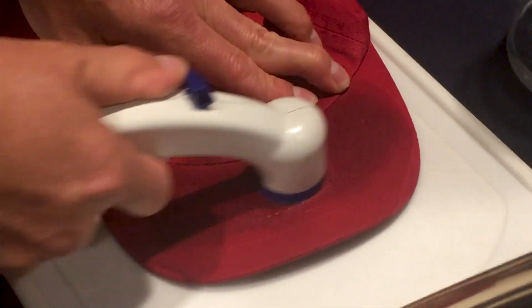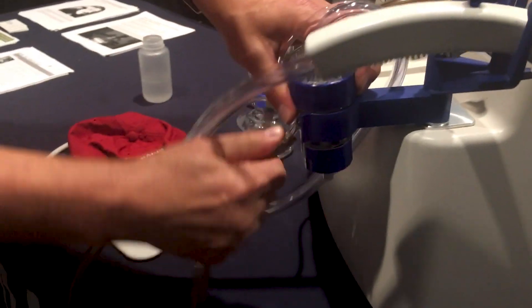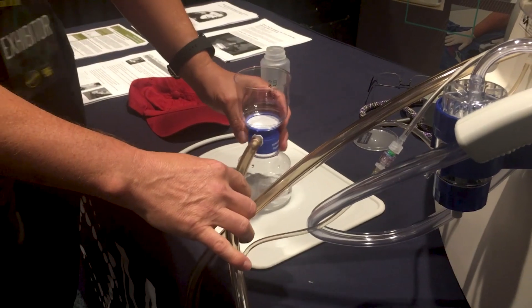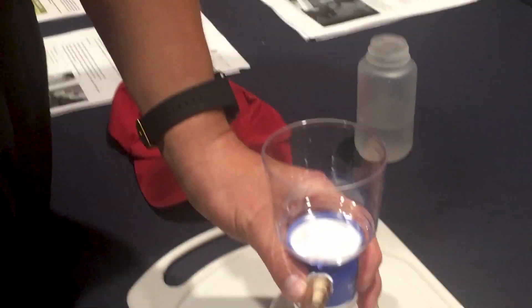It's exactly like a carpet cleaner. Once we're done collecting, we can take this model off. So this is your vacuum line — you take this line off here, and this is a 0.45 micron filter. It's small; the pores are small enough that it will catch any kind of cellular material.